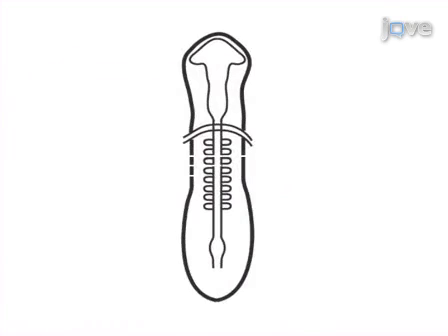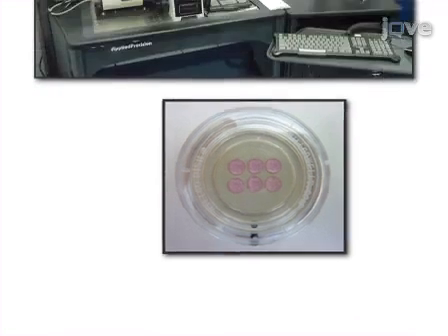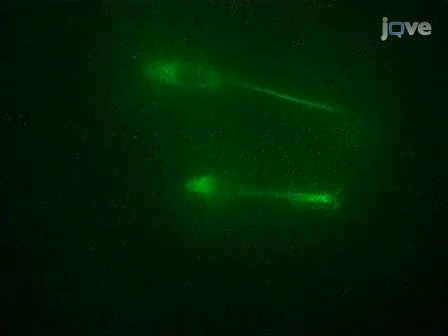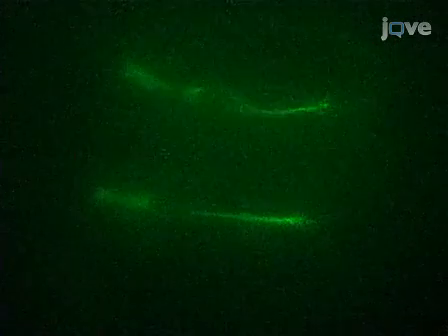The next step is to make slices of the early embryo and mount them onto glass-bottomed dishes. After recovery in an incubator, the embryo slices are imaged on a wide-field microscope at regular intervals. Ultimately, this technique can be used to study cell behavior within the developing neuroepithelium over long periods of time, with high spatial and temporal resolution.